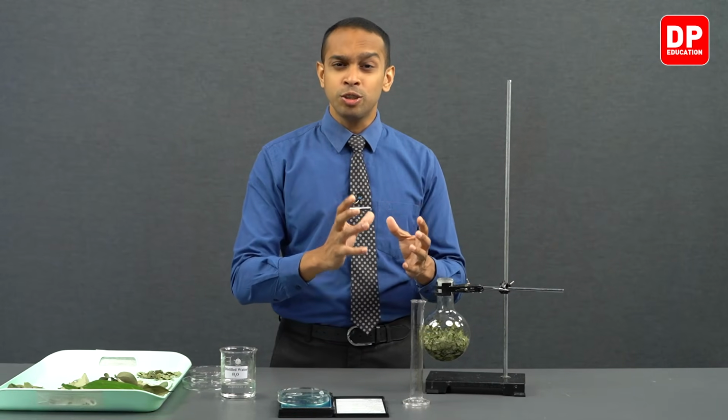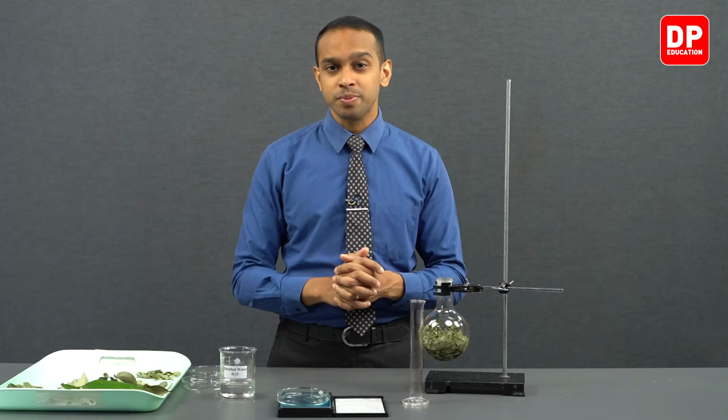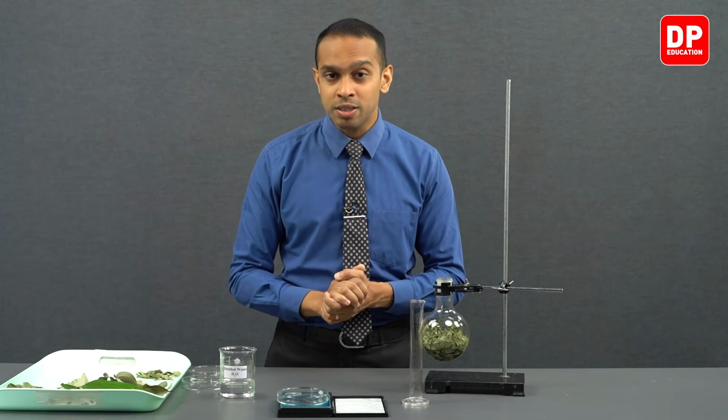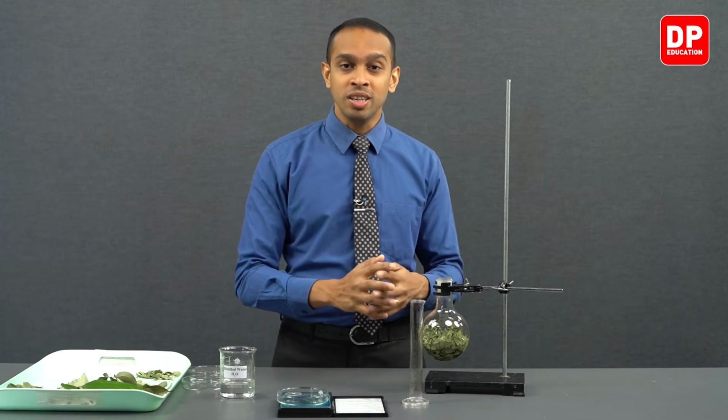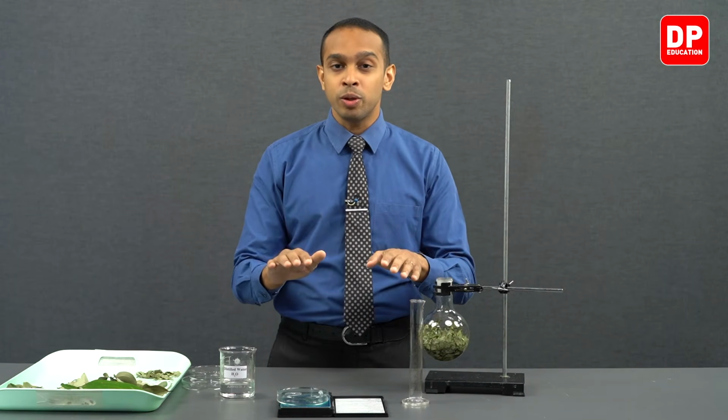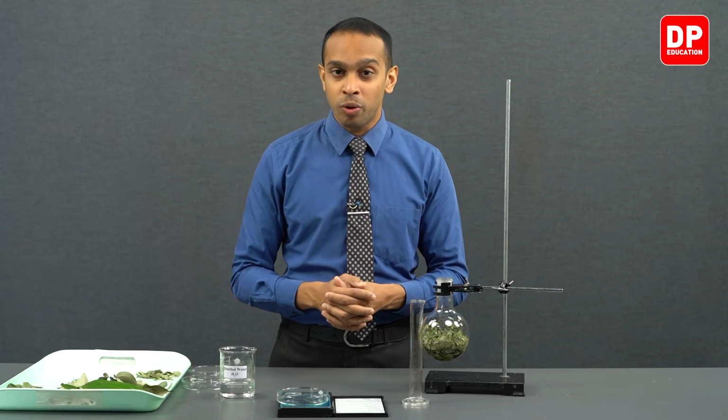If you carry out this steam distillation process, however, since the essential oil is going to be mixed with water, when you have two immiscible liquids present in a mixture, the boiling point of the mixture drops below their individual boiling points.